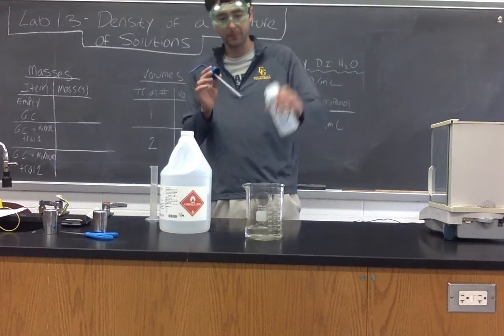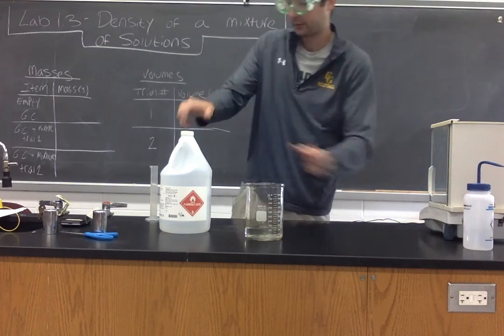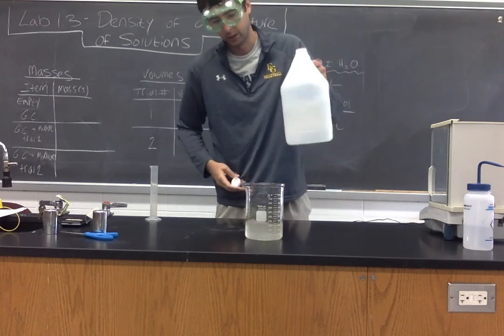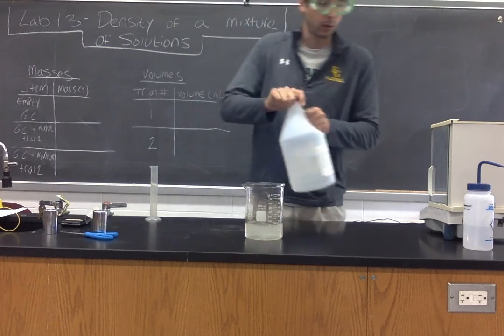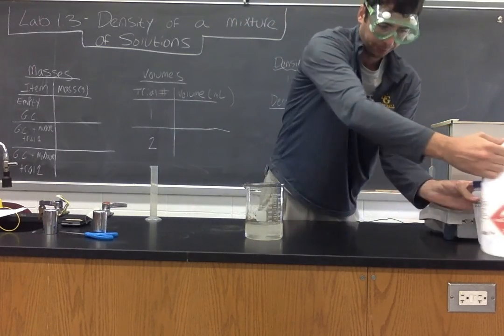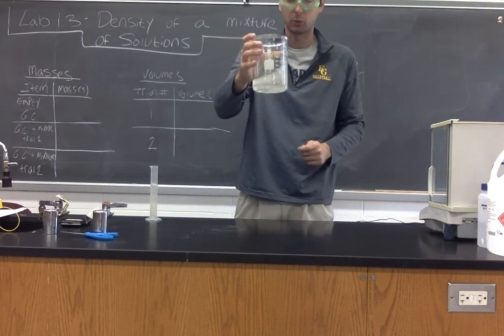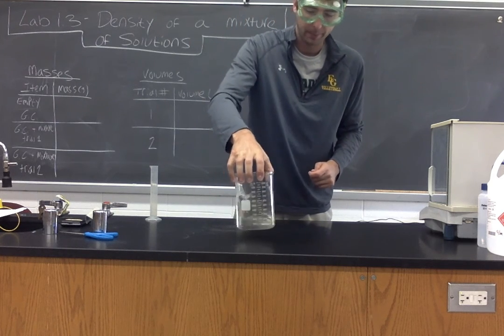As you can see here, I'm not measuring anything. There's some water and there's some isopropyl alcohol. So we are going to use density to help us determine what percent of this mixture is water and what percent is isopropyl alcohol. I'll stir it up here.